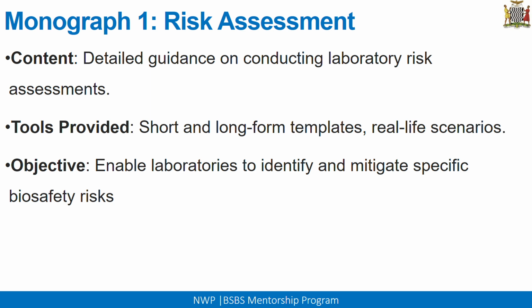In the risk assessment monograph, mostly this monograph gives a detailed guidance on how to conduct the laboratory risk assessment. But the only gap that this particular monograph has is that it concentrates mostly on how to conduct a biosafety risk assessment. So if you need more information on how to conduct a biosecurity risk assessment, you need to look it up in the Laboratory Biosecurity Guidance. So we're going to look at this particular document after the monographs.